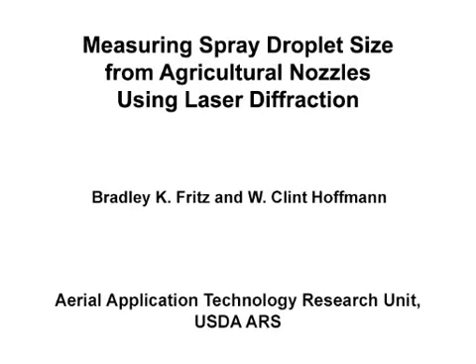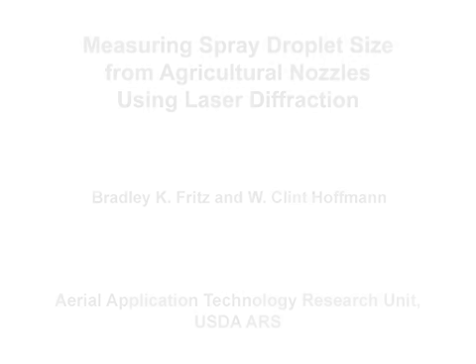The overall goal of this procedure is to evaluate the effect of nozzle type, spray pressure, and aircraft flight speed on spray droplets resulting from the use of ground and aerial application nozzles.